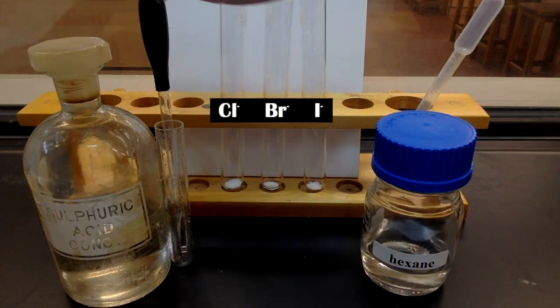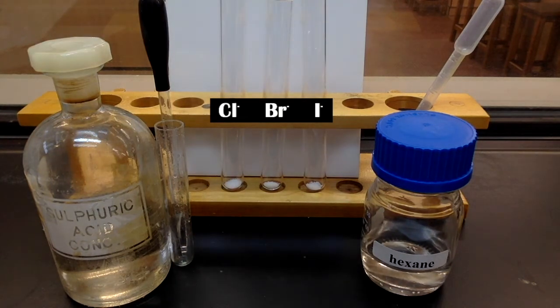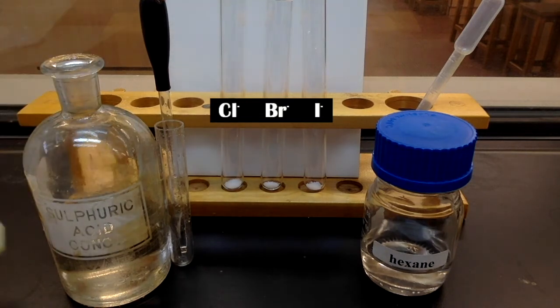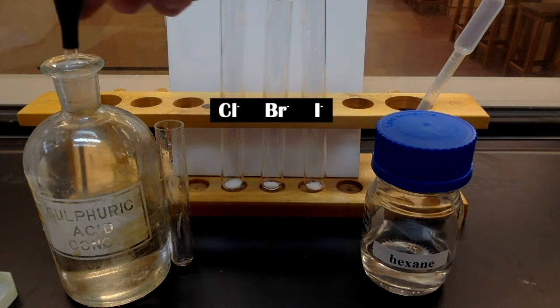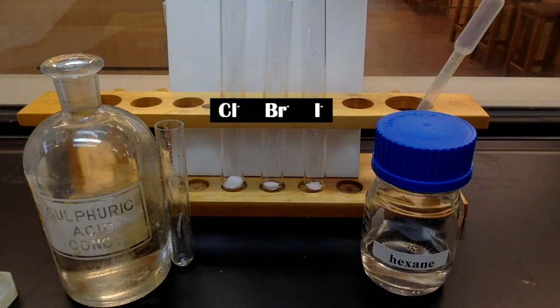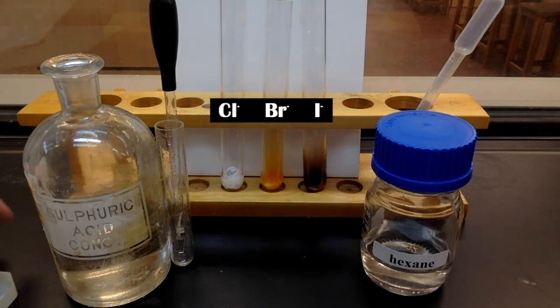Solid samples containing chloride, bromide, and iodide are prepared. A few drops of concentrated sulfuric acid were added into the samples. Orange vapor of bromine and purple vapor of iodine are observed.